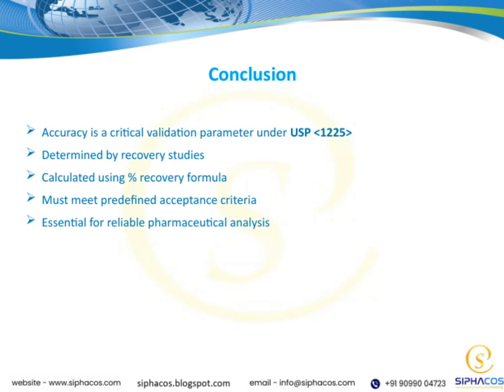Importantly, these results must meet predefined acceptance criteria to be considered valid. Overall, ensuring accuracy is essential for reliable pharmaceutical analysis, because it confirms that our methods truly reflect the true content of the drug substances or products we're testing.